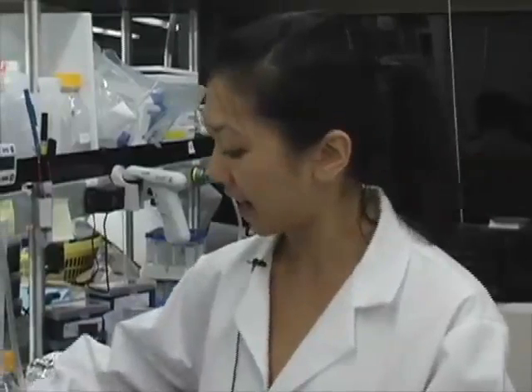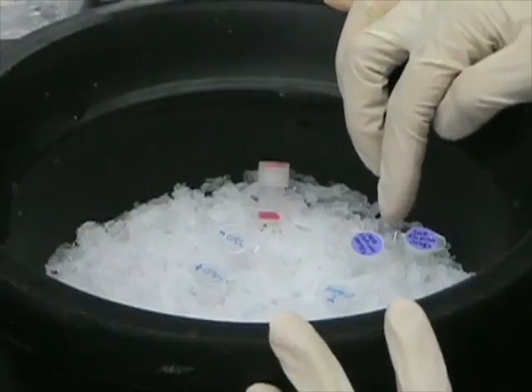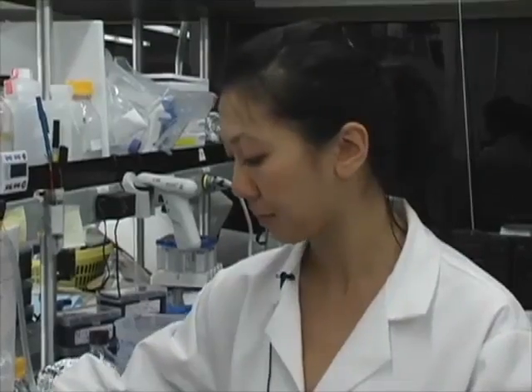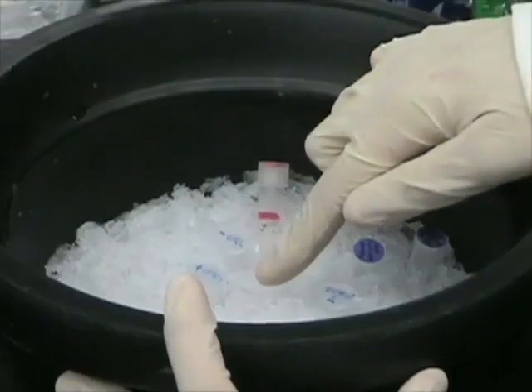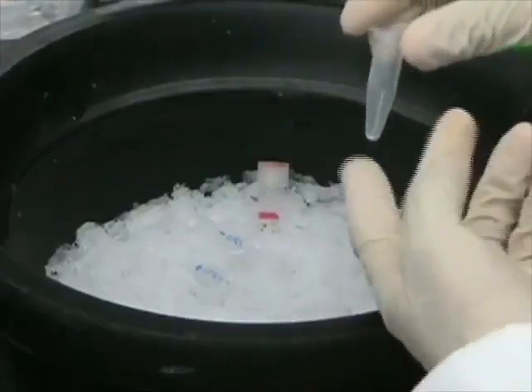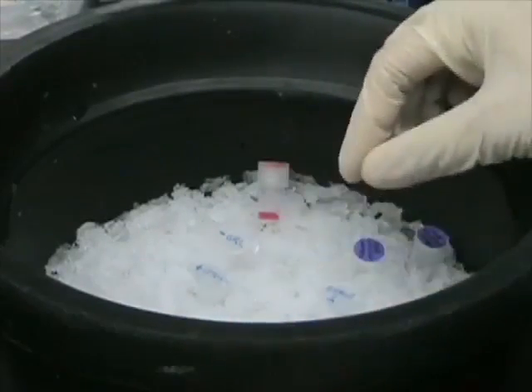In my ice bucket, I have the 2 primers that we'll be using to genotype, which have been specifically designed for our gene of interest and validated for qPCR. I also have my positive control for the gene of interest, my negative control, and a tissue sample that I've already collected from an adult mouse.